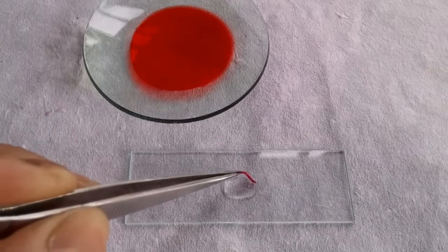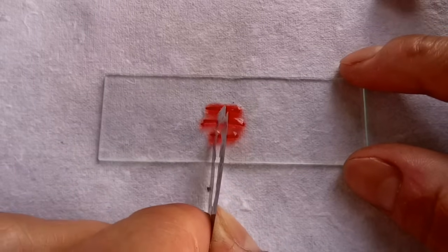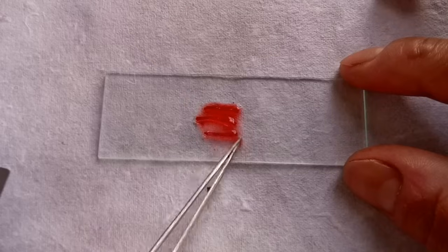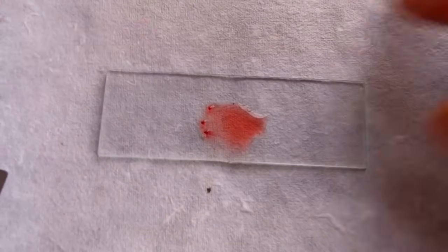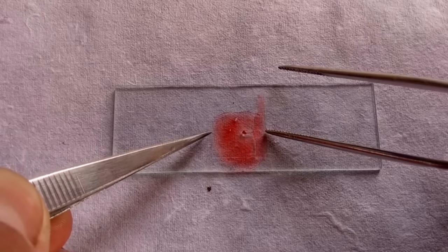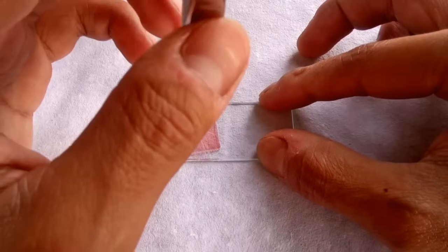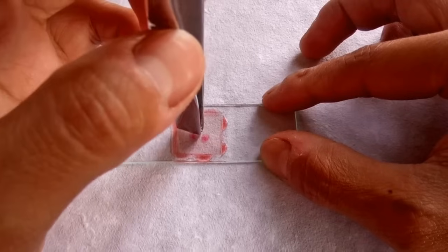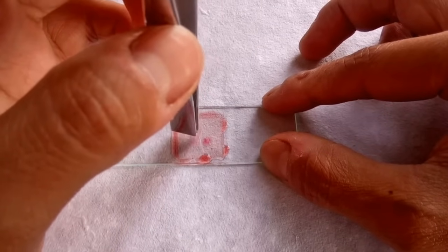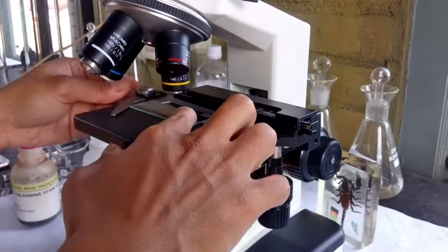Now transfer the root tips onto a clean glass slide containing a drop of water. Using a sharp blade or scalpel, remove about a millimeter of the root tip and discard the rest. The very tips of the roots are the regions with active cell division and are all that we require for mitotic experiments. Gently lower a cover slip on the root tips, making sure to avoid any air bubbles. Using the blunt end of a forcep or a pencil, gently tap the cover slip a few times until the root tips are uniformly squashed between the slide and the cover slip. A properly squashed slide will appear faint cloudy pink to almost colorless. The root tip slide is now ready for microscopic observation.